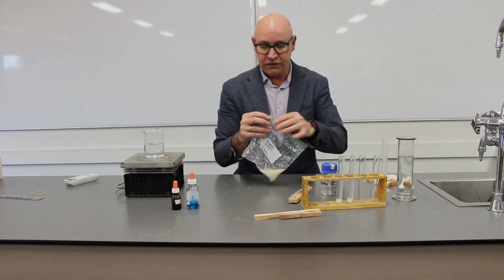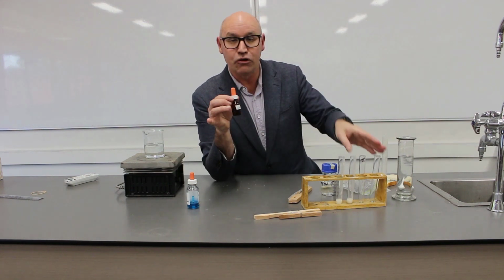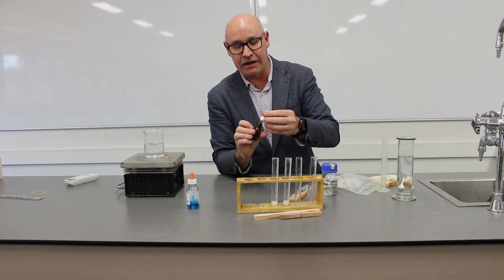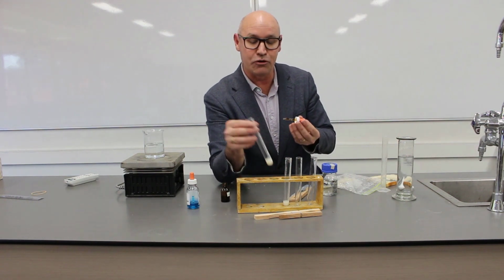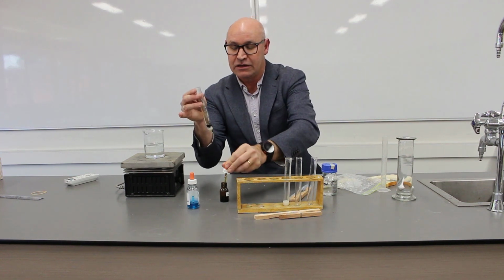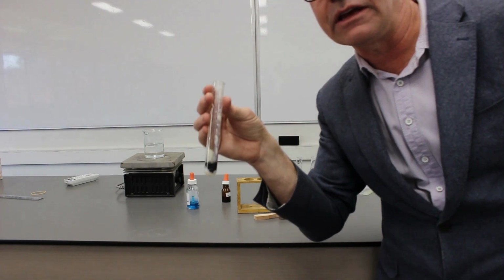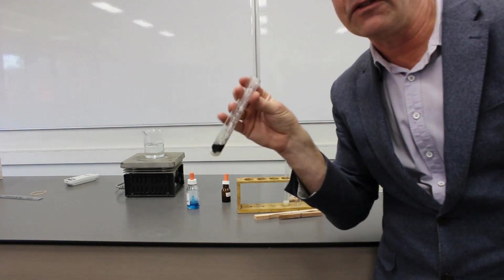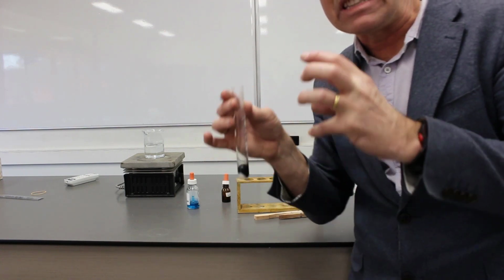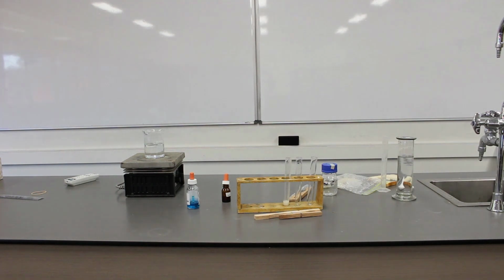Okay, so the starch test is using iodine, Lugol's iodine. Now the positive test for starch is a blue-black colour. And as you can see, that's already turned blue-black. So that's our positive test for starch. What does that mean? It means that our bread has got large molecules of starch in it. And we're not surprised by that.